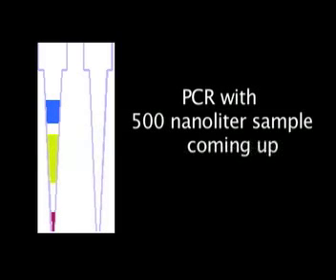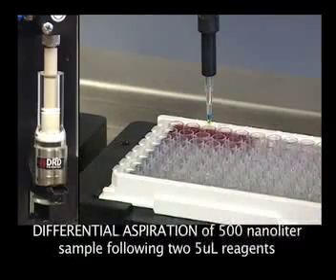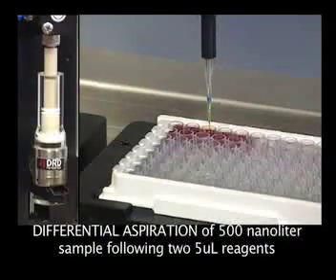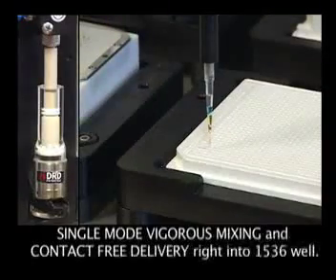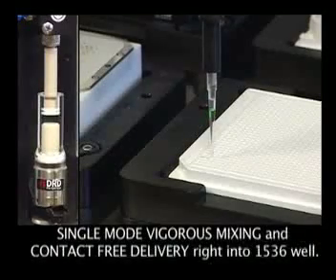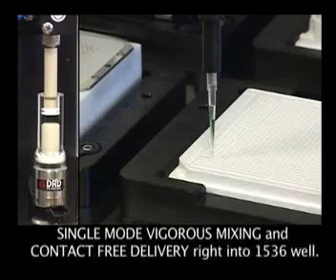A 500 nL aspiration PCR program is coming up. The pistons move to gather an adequate and visible .3 mm to accurately aspirate 500 nL. Then the pistons shift to single mode so they can provide vigorous internal mixing and homogeneity, and contact-free delivery to this 1536 well plate.